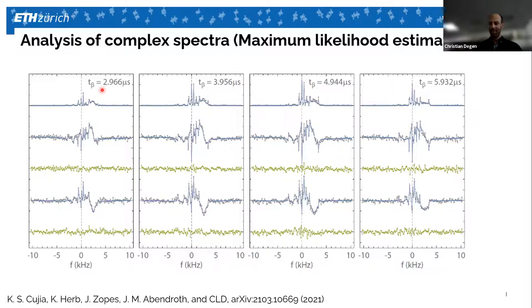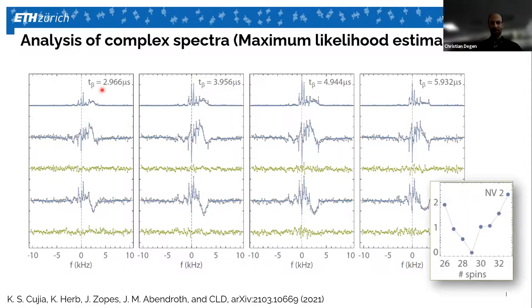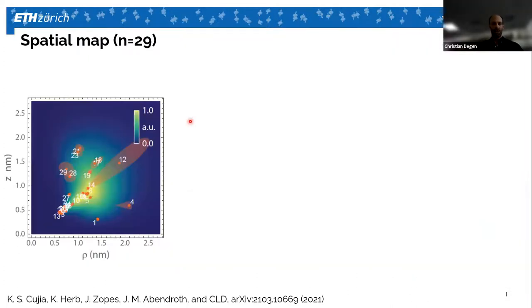If you want to know the details, I'm happy to follow up at a later time. I'm just going to show you the result here. We find, first of all, that we can fit about 29 spins into the spectrum. If you have more, it's overfitting. And we can start localizing them, including error bars.